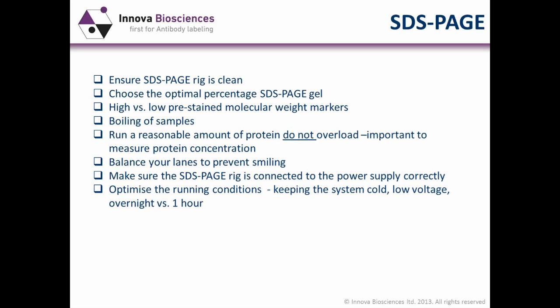So the SDS-PAGE gel, again, I'm going to assume that everyone is aware of the various rigs that are out there and has a basic understanding of the procedures. This is more of a high-level understanding to offer some advice in regards to the SDS-PAGE system. One thing is to make sure that your SDS-PAGE rig is clean, whether it be a small or a large rig, because what you don't want is residual proteins left over from previous runs running through your fresh gel as you're resolving your current proteins of interest.